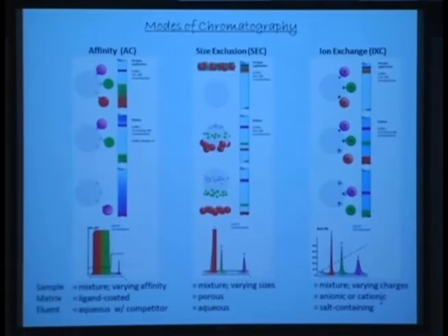So typically what happens is that you start with, let's say, 20 millimolar salt. Very few times you start with zero salt. You can, but under zero salt conditions, it's not very helpful in terms of lots of other things. You start with a very small amount of salt and you gradually increase it. And for really high affinity, I'll give you an example. Antithrombin binding to heparin is a very tight interaction. The affinity for polymeric heparin is sub 10 nanomolar. It could be 4 nanomolar, 5 nanomolar. It's fairly strong. You disrupt that interaction between antithrombin and heparin with very high salt.